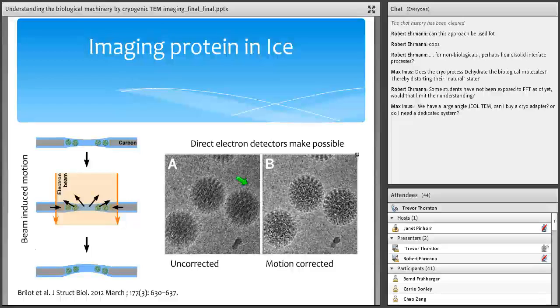We've studied this quite extensively, and what we think is happening is the electron beam, when it hits the water, causes the water to basically dome. When we look at large viruses, we can actually see them rotate a couple of degrees. In other words, they actually roll. We have a researcher here that works on diamonds, and we were able to actually get her diamonds to flow through the water as we imaged them, because they're moving much more than even biological material would. And we say water, but actually it's ice, right? So it's a nominal solid, but these things are moving through this solid water.